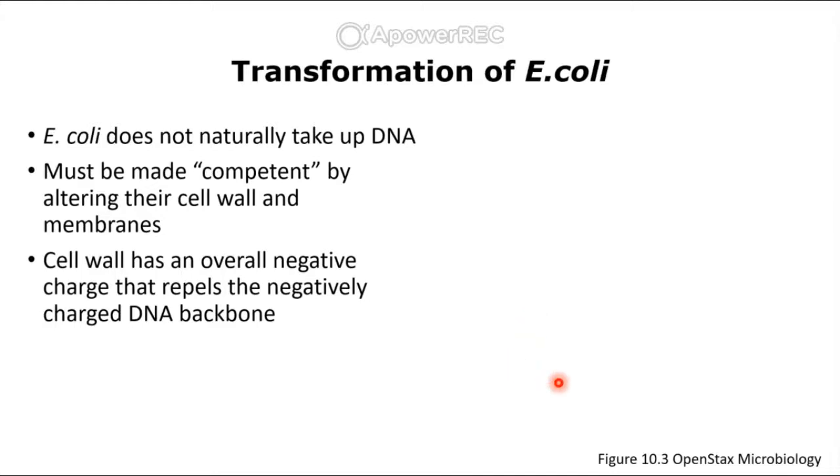Now, we typically use E. coli to do these transformations because E. coli is a very easily culturable bacterium. It's the most well studied of any bacteria out there, and it's really good at producing genes and making compounds in industry that are useful for us and economically viable. And so it's a really good host for this process right here.